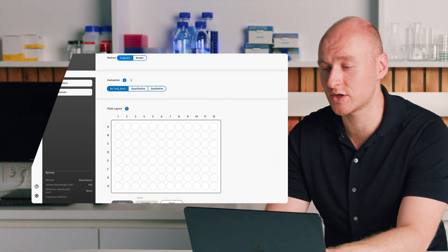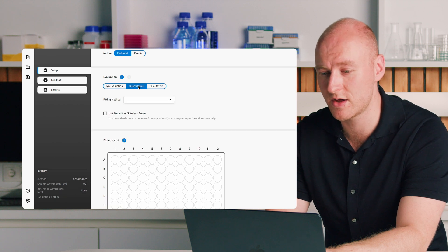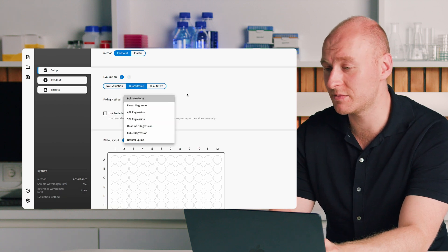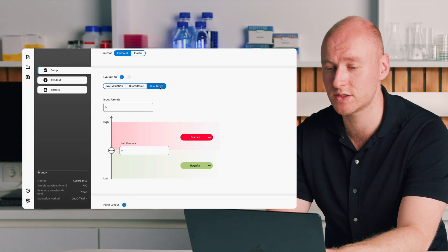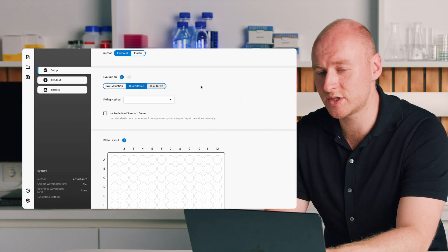Our software does offer many analysis possibilities. Moving to quantitative, we can select a fitting method — useful if you want to plot a standard curve and calculate the concentration of an unknown. We also have qualitative analysis, used to answer yes-or-no, positive-or-negative questions: is this present in my sample or not, not necessarily in what concentration. We'll stick with quantitative for the purposes of the demo.